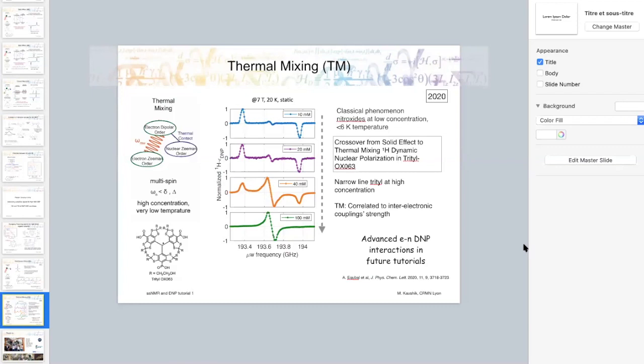Polarity, we can do experiments on organic solvents, polar as well as apolar. Maybe, do you mean to ask about conducting samples? Sometimes there are samples that are magnetic in nature. They tend to have problems spinning in the MAS setup because they tend to be influenced by the magnetic field inside the magnet and go towards the coil.